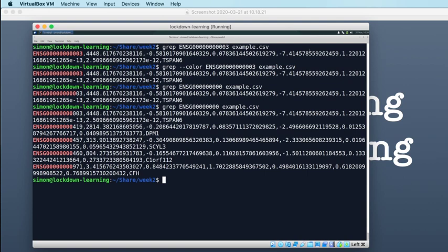Okay, so that's useful, and there's nothing necessarily that these genes have in common other than the fact that they have a small Ensembl gene ID number. That doesn't necessarily mean anything in terms of their function or anything like that, but we can use this to illustrate some other functions of grep.